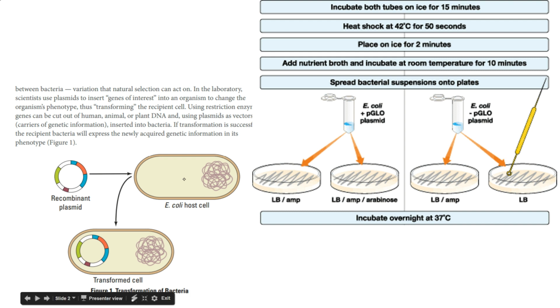But this lab has a couple of unique things to it, because in order to make this E. coli receptive to picking up the plasmid, we're going to mix the E. coli and the plasmid separately. You don't buy them together. You get them separate, you put them in, and then ultimately you try to transform this bacteria.